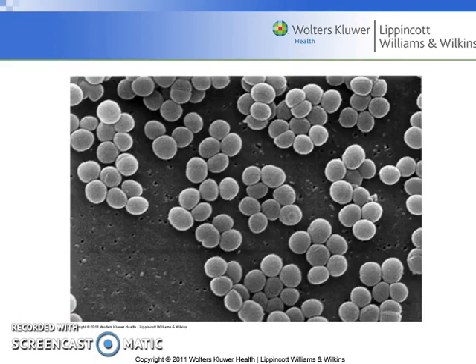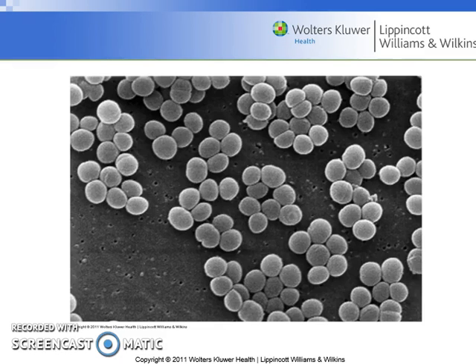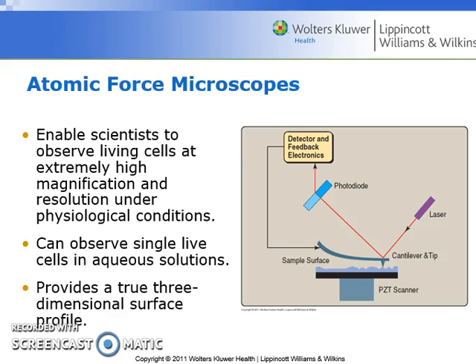So that's the image of our scanning electron microscope. Nowhere near as good as a transmission electron microscope, but still very, very useful in helping us understand the external structures of a microscopic bacterium. Okay, the last microscope that we'll talk about is called the atomic force microscope.